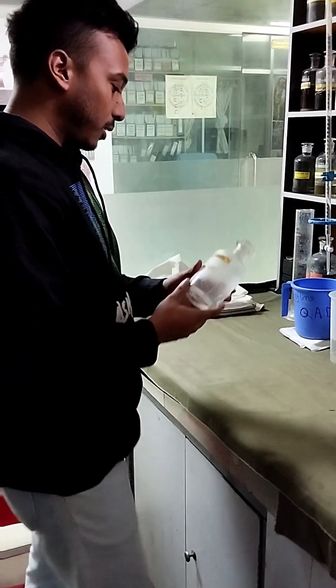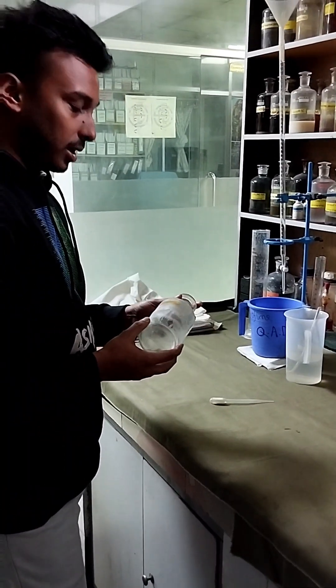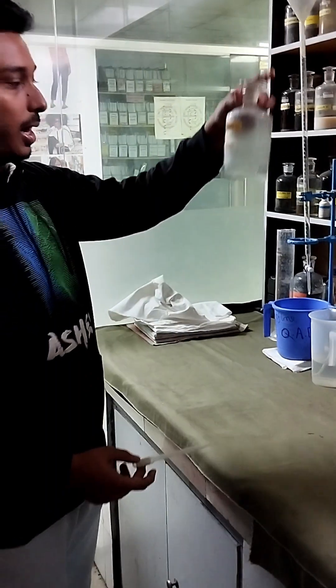Today we will test the purity of hydrogen peroxide. We know that hydrogen peroxide is a very essential chemical for our textile dyeing section. Let's see how it can be tested. This is a hydrogen peroxide sample.